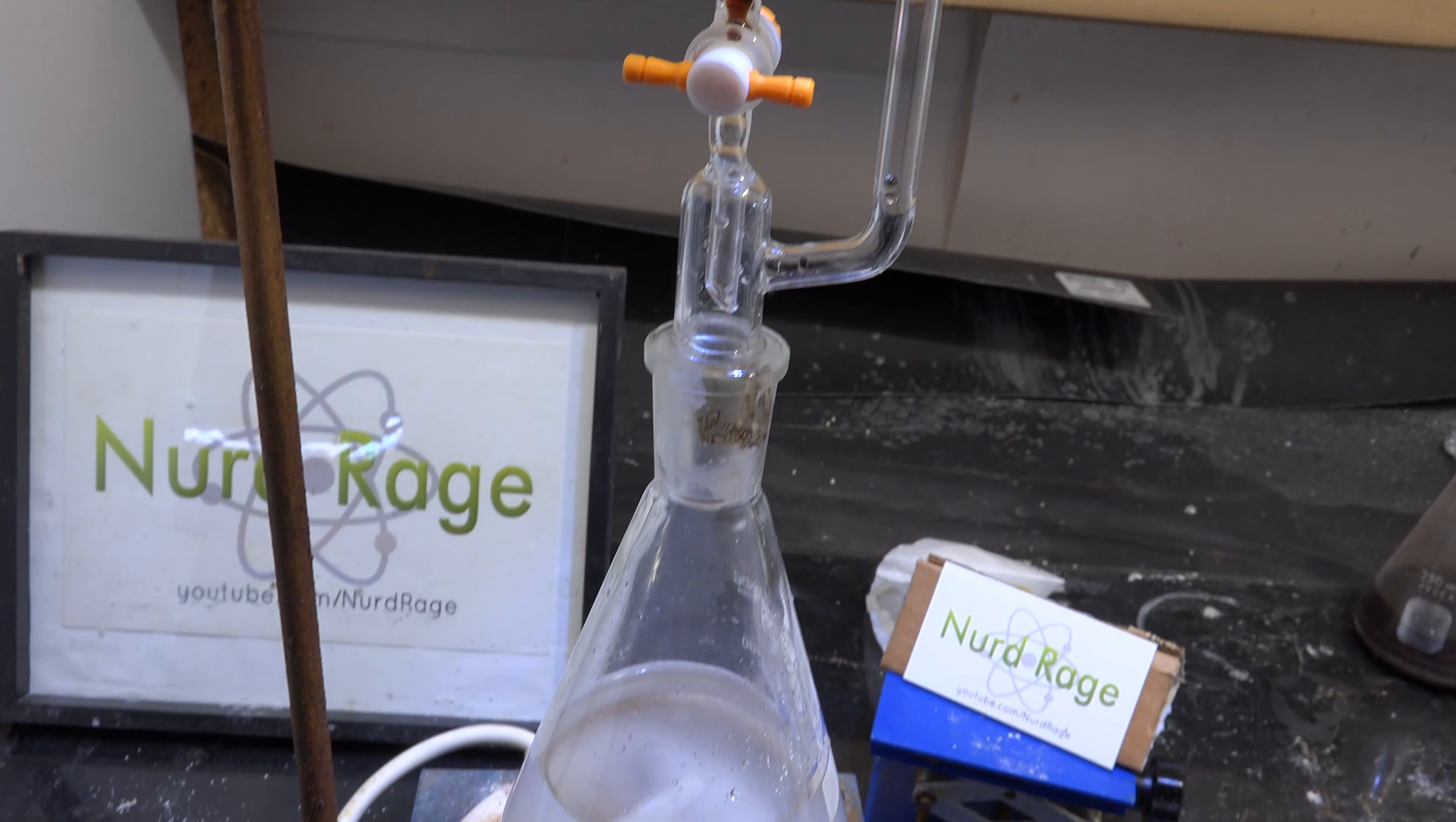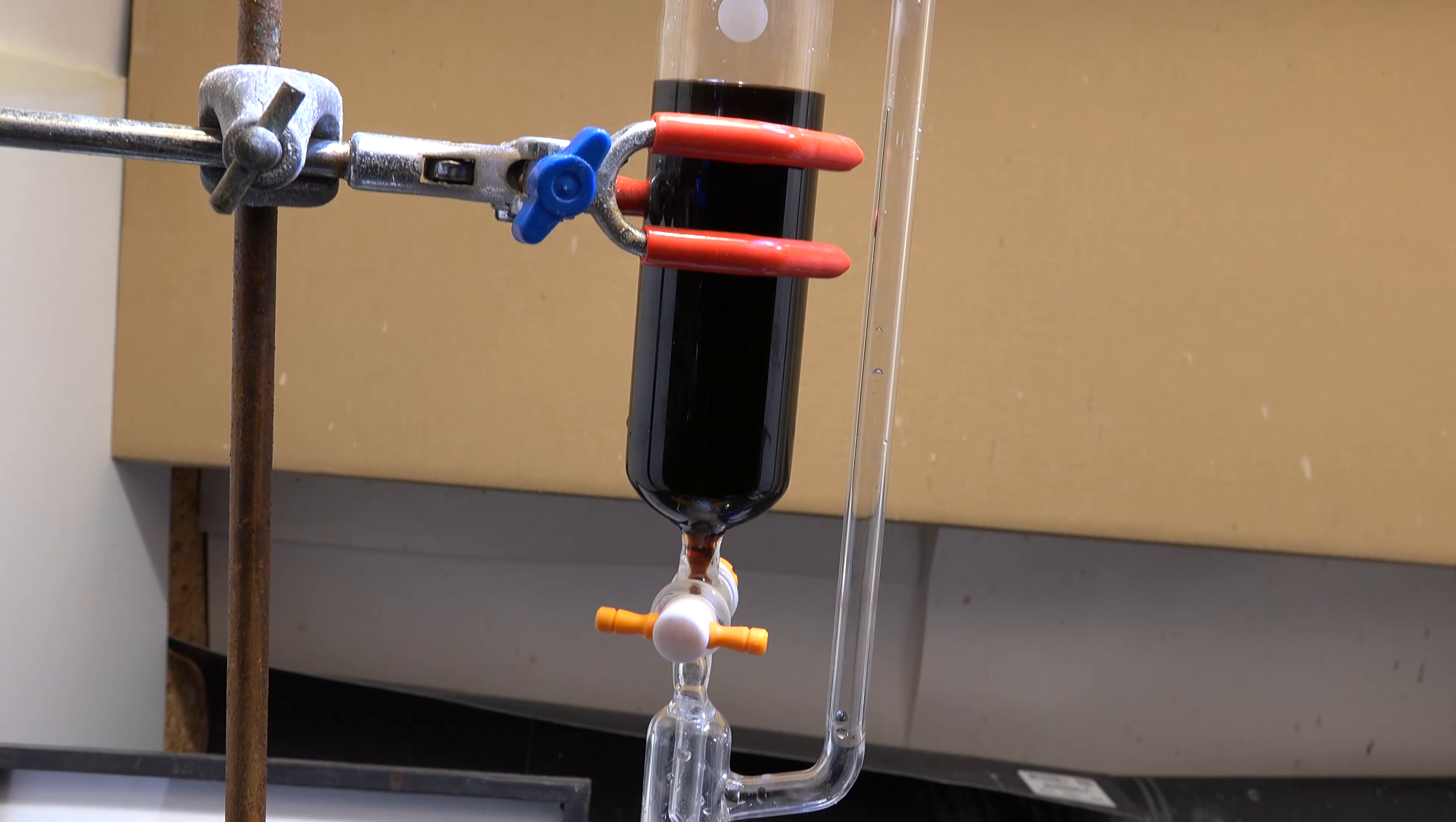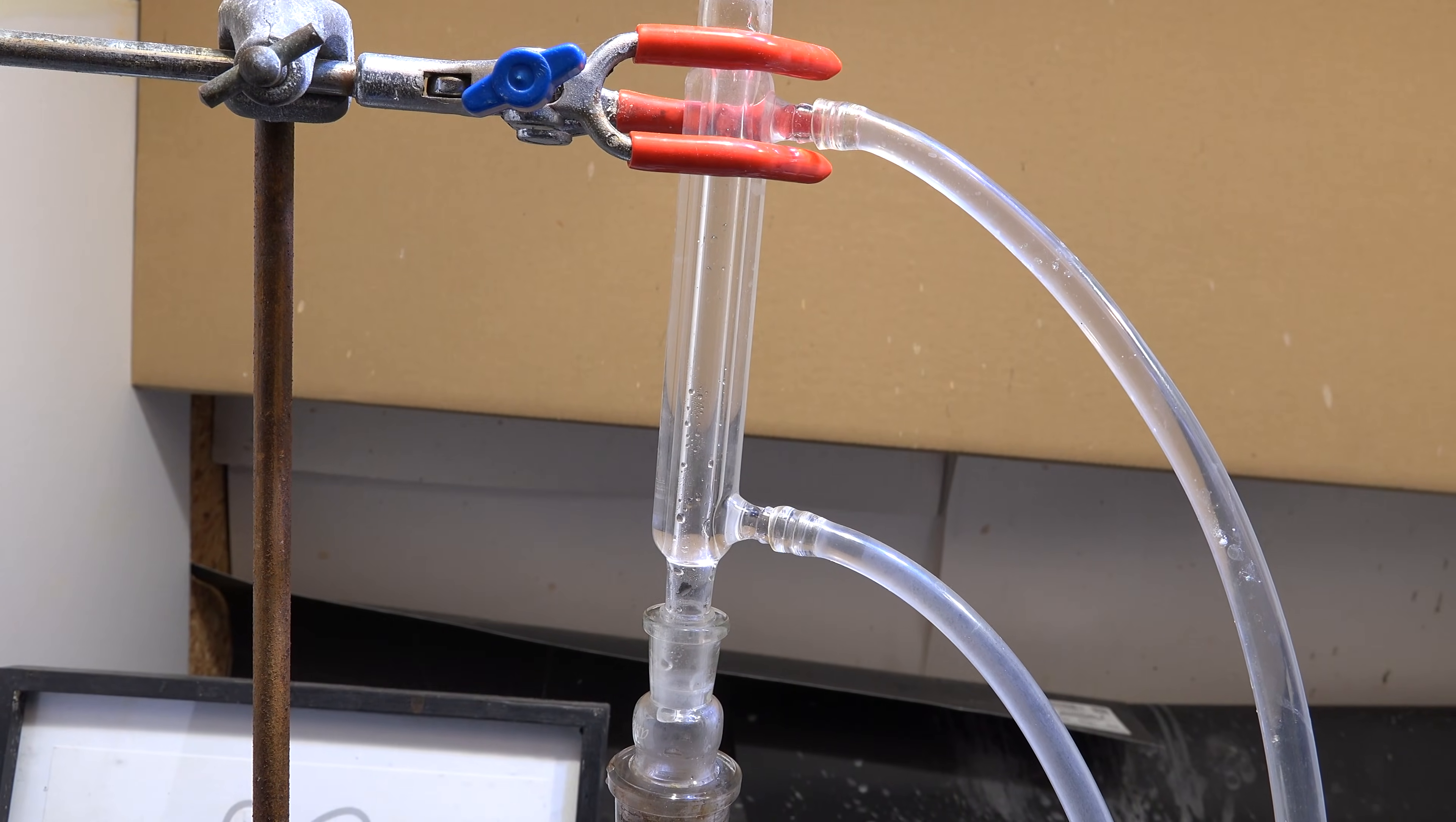To add in our sulfuric acid we set up a pressure equalized addition funnel filled with 100 mL of concentrated sulfuric acid. Mine is brown because I'm using low grade drain cleaner acid. We slowly drip in the sulfuric acid careful not to boil the mixture as it heats up. Once it's all in, we replace the addition funnel with a reflux condenser.